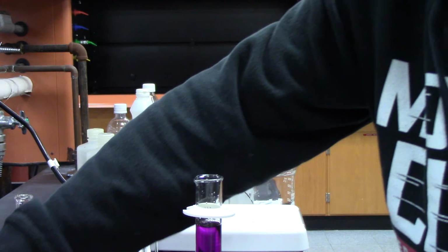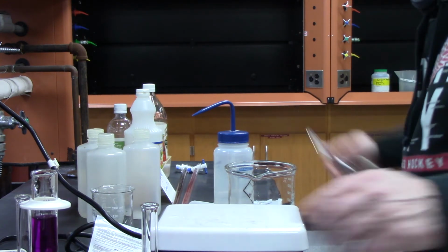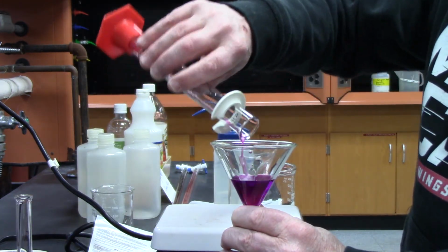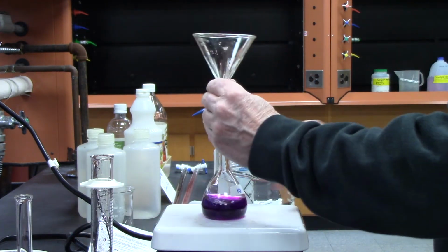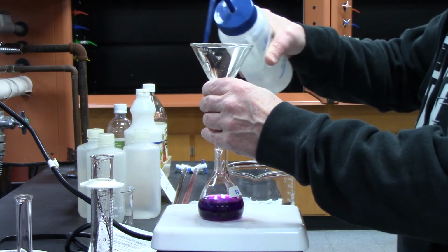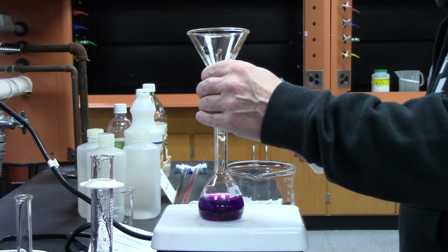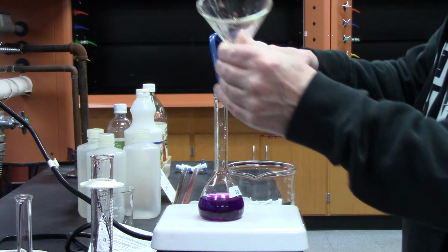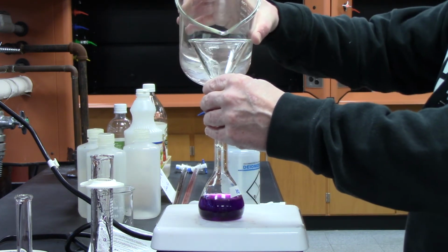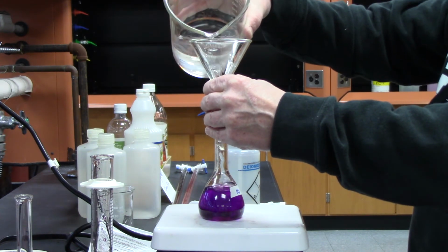All right. So 50 mils of number 1, and I'm going to add it to the volumetric flask. I want to rinse out the funnel. I could have done this in a beaker as well, but ideally, I guess you should do that. But here you go. Now I'm going to add the rest of it water. I'm making 100 mils of this, so I'm going to add water again to the bottom of the neck. Gotta be careful here.